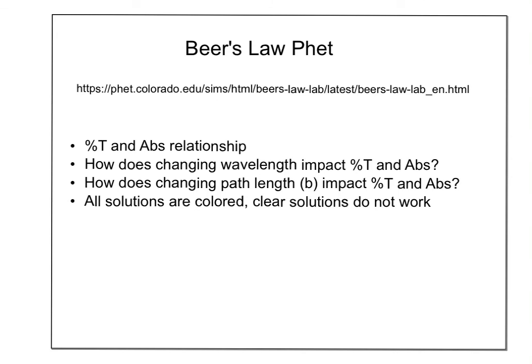All right, here's what I would like you to do as a follow-up today for this video. This simulation link is on the agenda, so you can click the active link instead of typing that all in. And I want you to explore the percent transmittance and absorbance relationship. So for example, why don't you start by adjusting the concentration of the solution until you get a percent transmittance of 14%, and then I want you to see what the absorbance is. That was just the problem we solved. So let's see if the simulation matches. When you have 14% transmittance, does the absorbance match the previous problem?